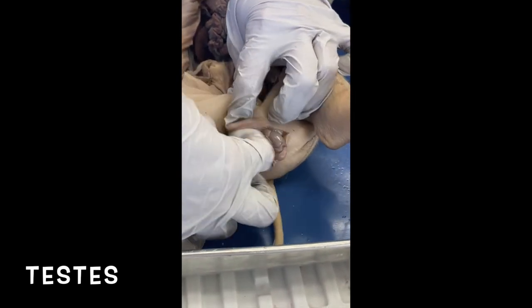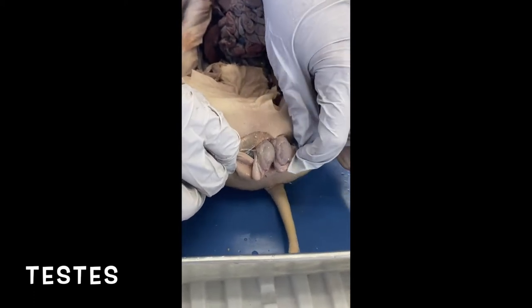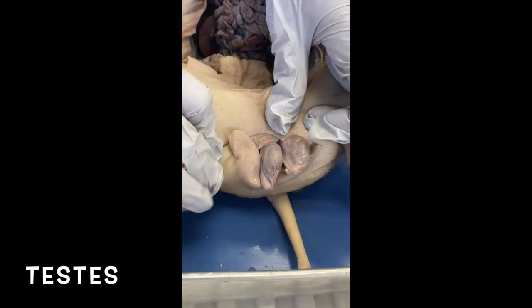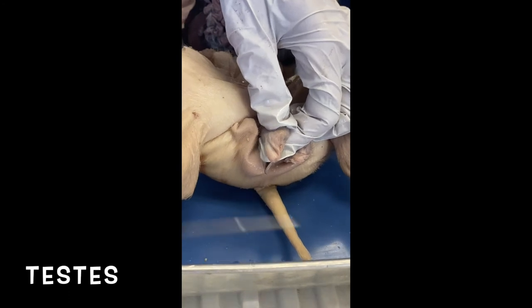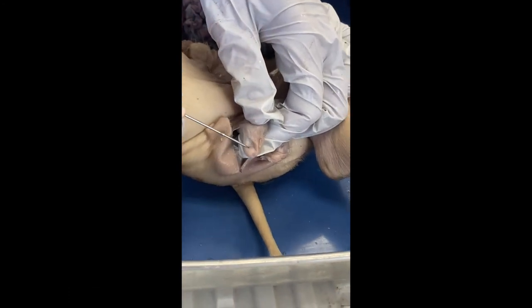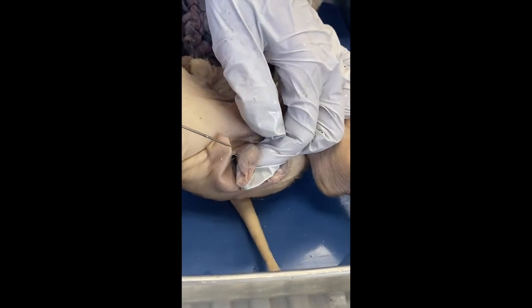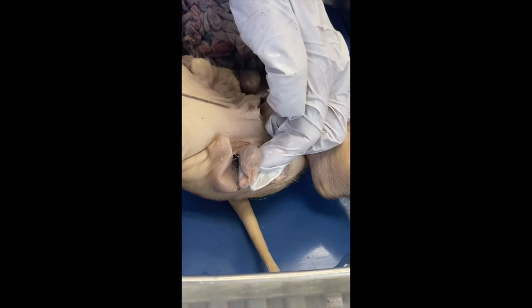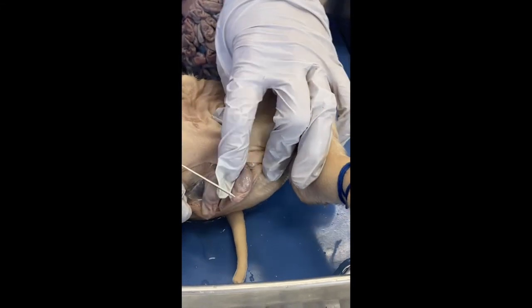There they are, testicles. Now, you can kind of see there's one, there's the second one. This is the epididymis, I believe, where sperm would be stored. So there are different areas of the testicles where it's made and then where it's stored. And there are tubes that lead all up into the male anatomy. But there they are, folks.